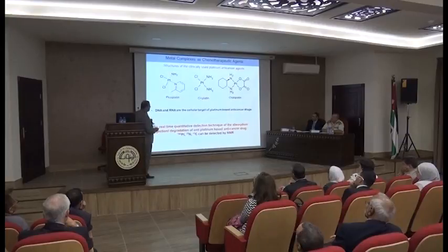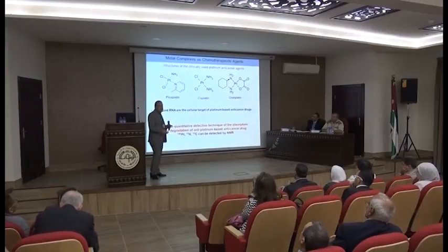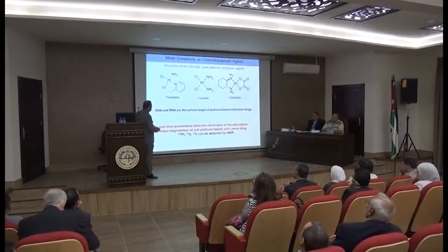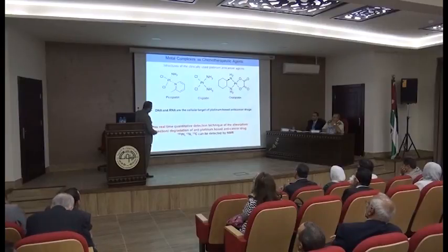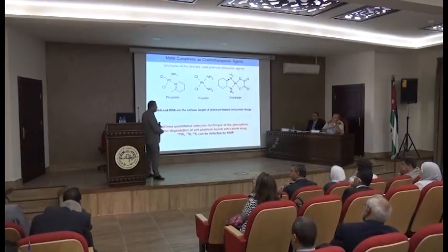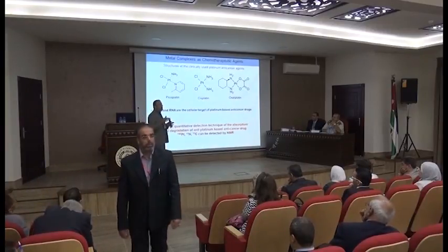And this information, how long does it stay inside, where is the connection, and what's the mechanism? It's unknown because we are just applying its application. We don't use NMR to know exactly the mechanism and the time. And this is one of the ongoing research in this field. There were also some people using indirect detection to find out the satellite of the platinum. But in this research, we were able to directly study the platinum, not rely on the satellite, because the satellite is very low concentration and also it has coupling.